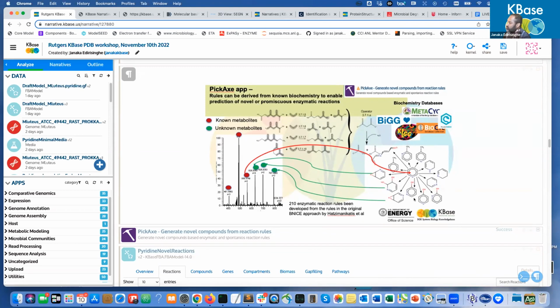It's worthwhile to mention that if we have additional phenotypic data, such as metabolomics, we can map the metabolomics onto these newly generated compounds based on the molecular weight. But in this specific use case, we don't have metabolomics, so we don't talk about it.